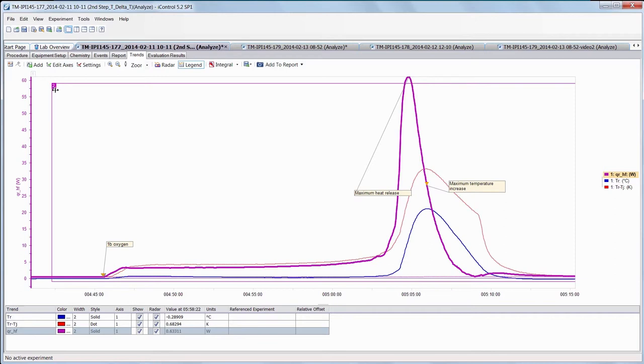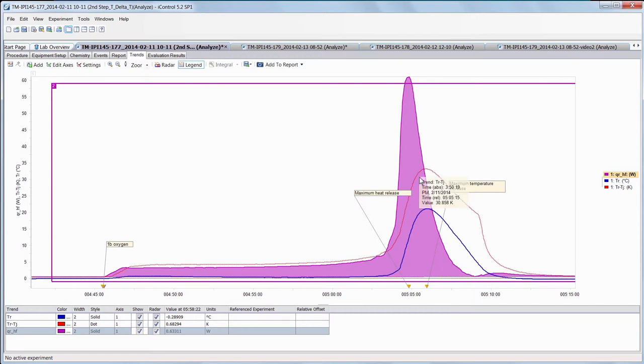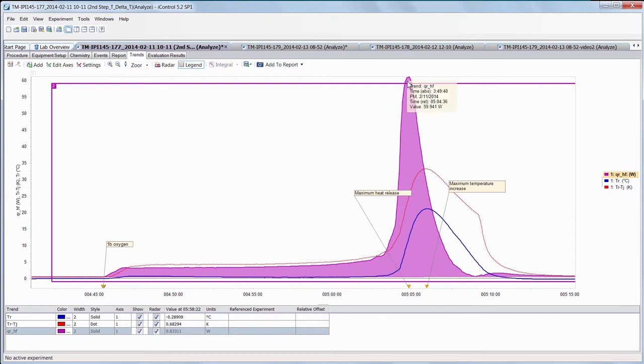So reaction calorimetry on the EasyMax picks up the maximum a little bit before the temperature in the vessel reaches a maximum, but it also gives you a quantitative indication of how much heat is coming out. You have three, four watts here to begin with, it's about 30, 40 watts per liter, again not huge but significant, and it goes up to about 60 watts at 100 milliliter scale. That corresponds to about 600 watts per liter.